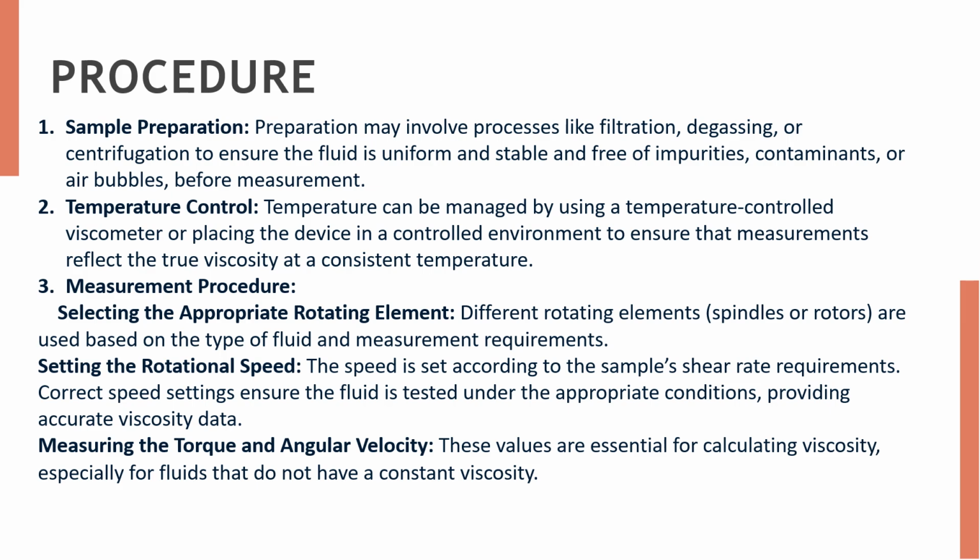Next, we have to measure the torque and angular velocity. These values are essential for calculating viscosity, especially for fluids that do not have a constant viscosity. If we use an advanced rotational viscometer, we can directly get these values, meaning these values are directly displayed on the user interface. But if you use a traditional viscometer which has a dial in it, then we have to do calculations manually.